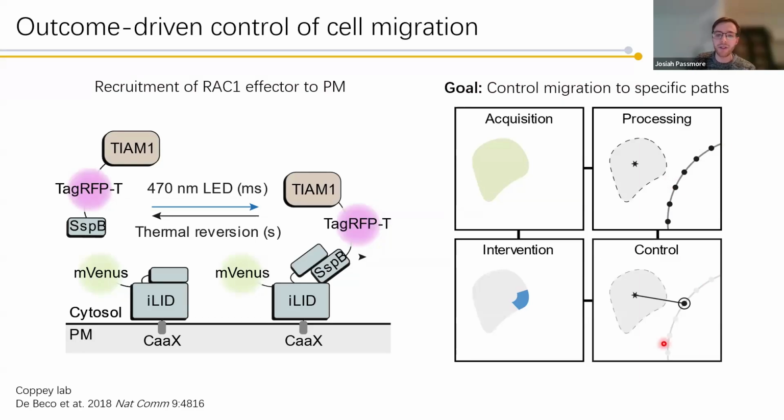And our control algorithm would then look at where the cell is in relation to this path and decide where to illuminate. And then our intervention is that our microscope will illuminate that side of the cell in order to bring it towards the path. And because this is all done in a loop at every single time point, over time you can imagine that you can bring your cell along your path just by continually updating which checkpoint you're setting.